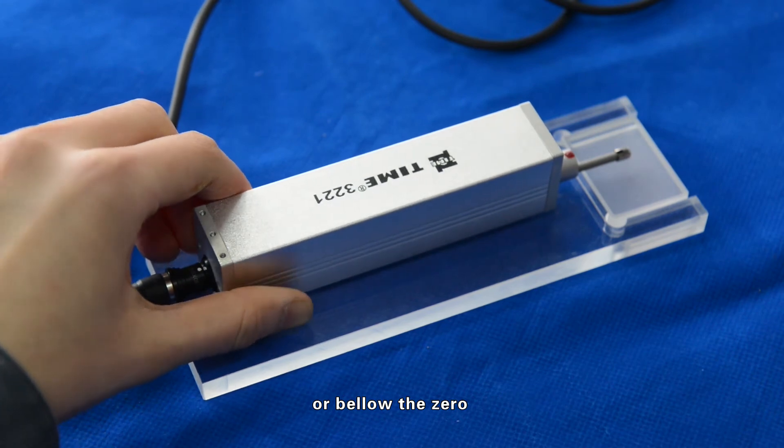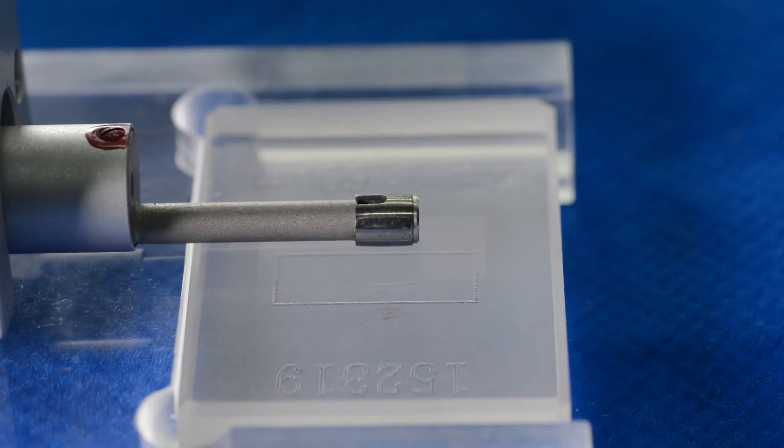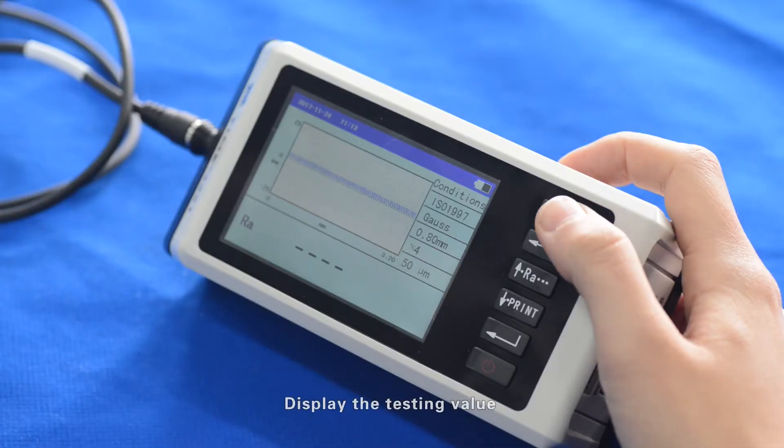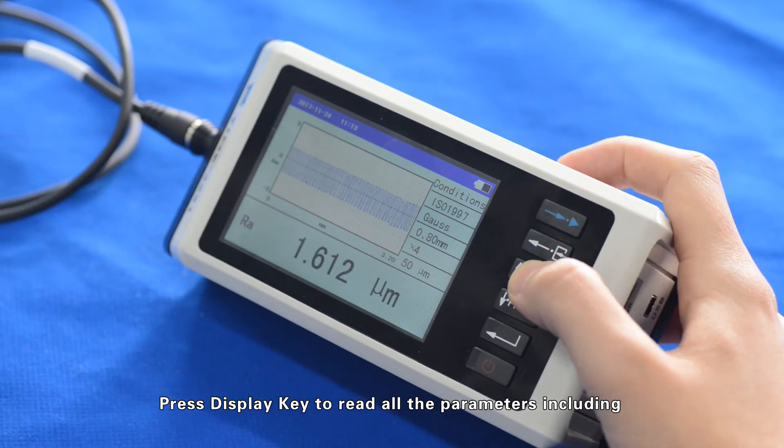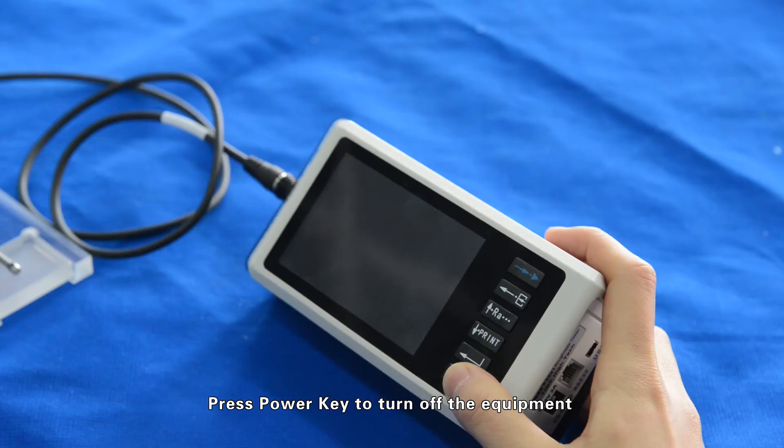Press the Start key to begin measurement. When finished, press the power key to turn off the equipment.